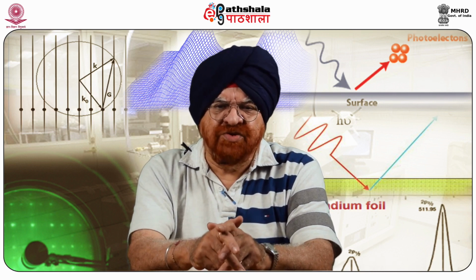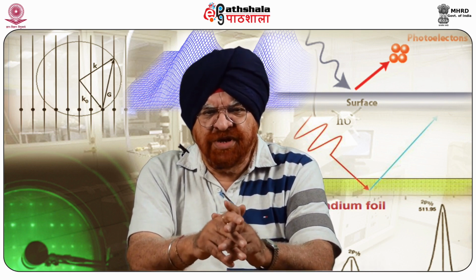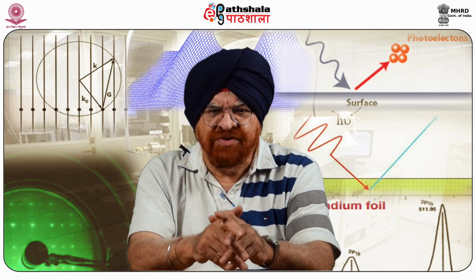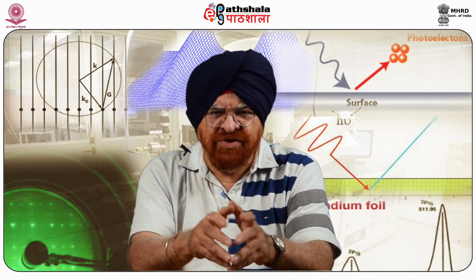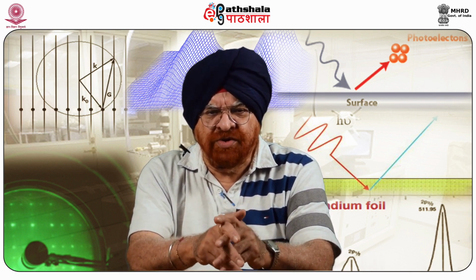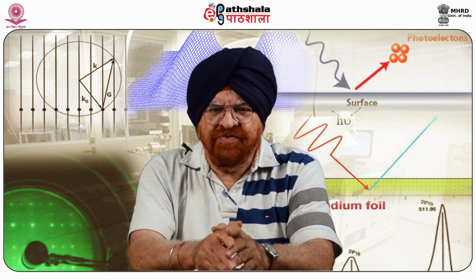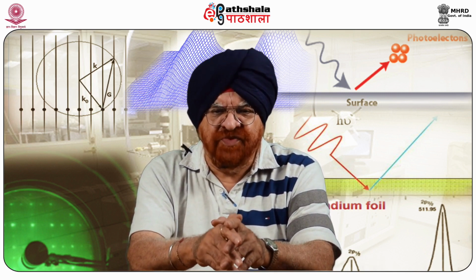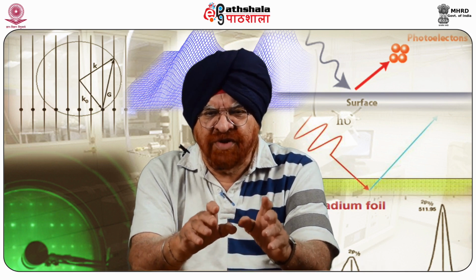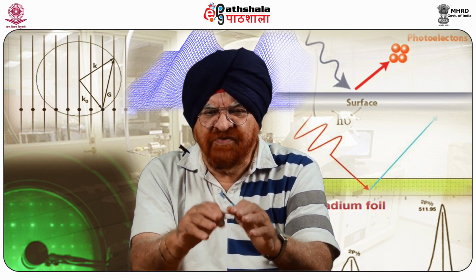KPFM is primarily based on the instrumentation of an AFM system. That means the basic principle remains similar in both. AFM operates in contact, intermediate, which we call tapping mode, and non-contact modes. In contact mode operation, the AFM tip touches the sample surface and the tip sample repulsive force deflects the tip cantilever. The cantilever deflection is monitored and is used as a feedback signal to know the extent.